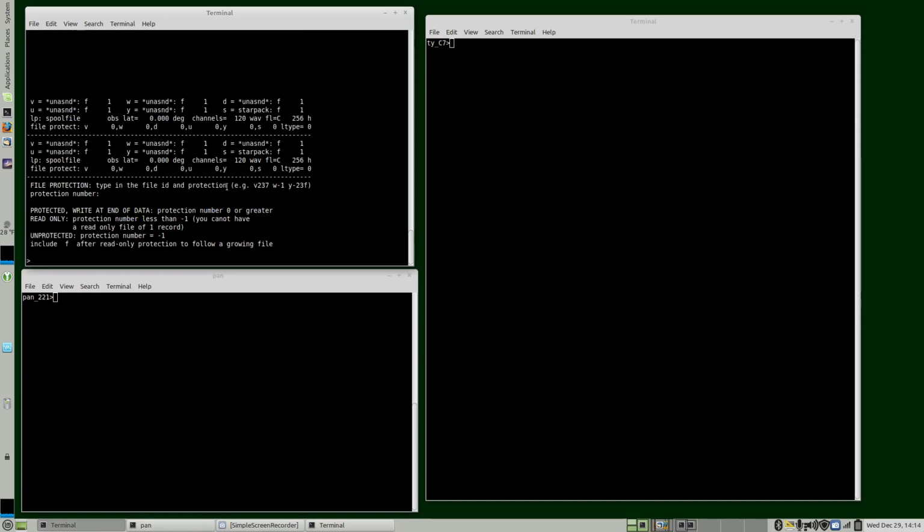So SpecPR has 6 files that can be assigned at any one time. In practice, any one file can contain more than 1 million spectra, and you need 7 digits of places to give the record number, and there are some places where that's the limit. If you go over that, you won't see the record number.